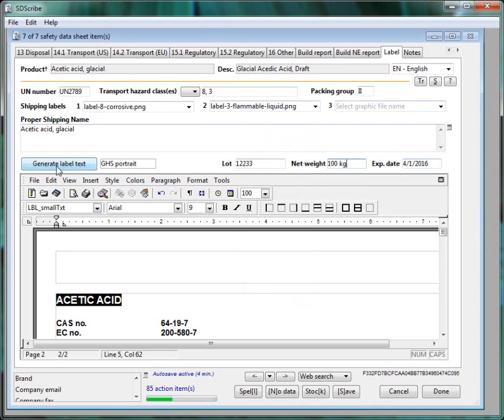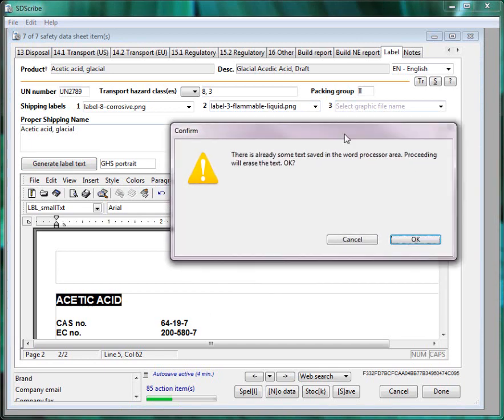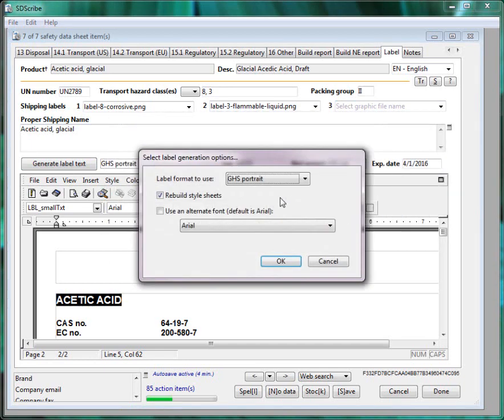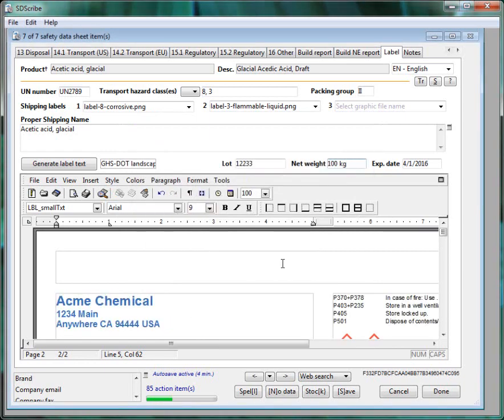Then we press the Generate Label text and it allows us to either do a GHS portrait and this is the in-house label or the GHS DOT landscape and this is the shipping label.